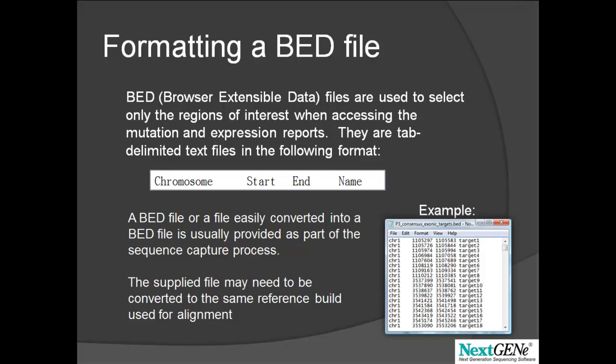A bed file, or a list of capture regions, is usually supplied as part of the sequence capture process. The bed file must be properly formatted to work with NextGENe, and the position of the regions must be for the same reference build used for alignment.